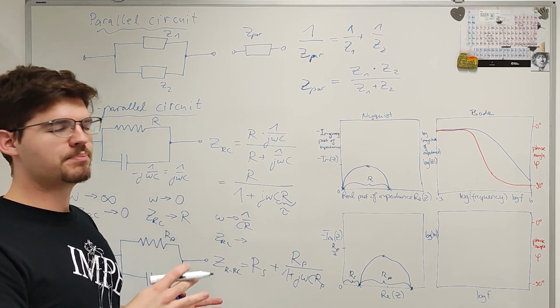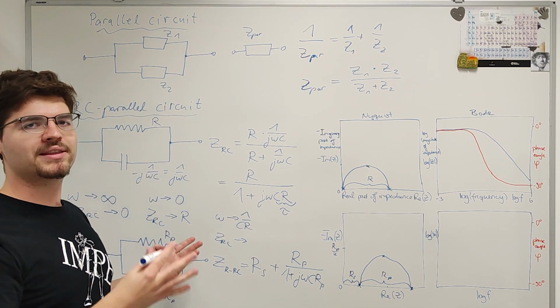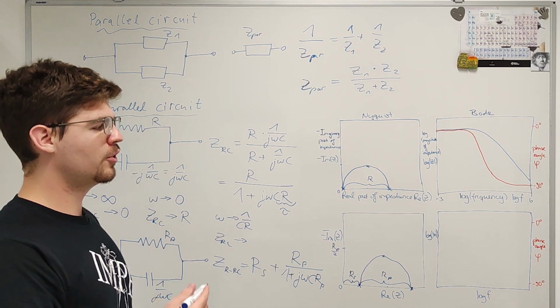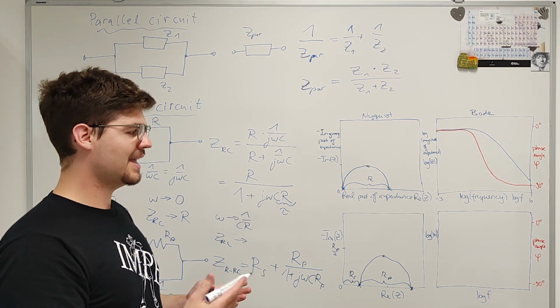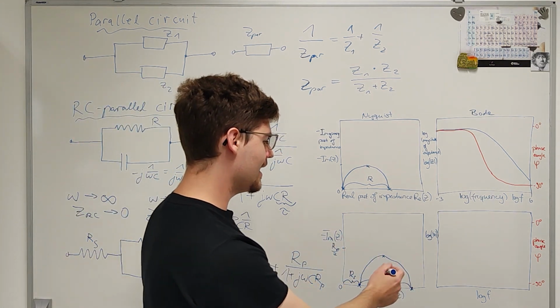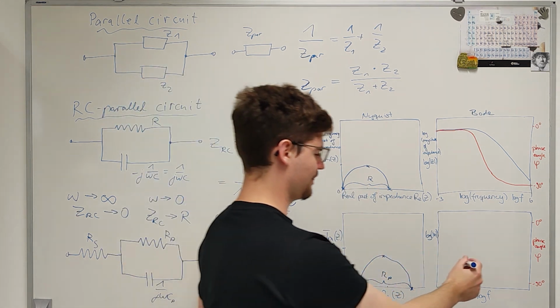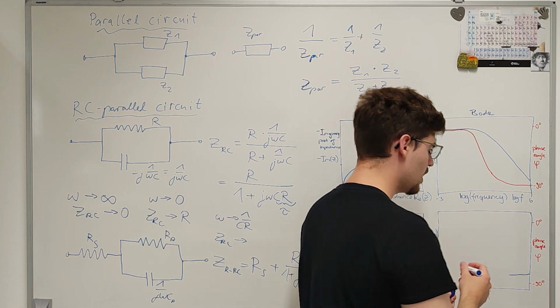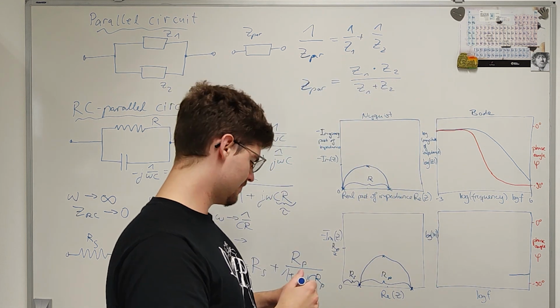And so all the current that passes through here is not hindered by the capacitor, but only by the series resistance. And so for high frequencies, we would expect again here a resistance and resistive behavior and a flat plateau where the phase angle is 0 degrees.